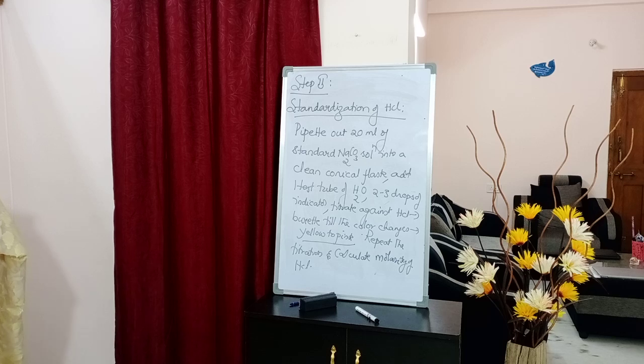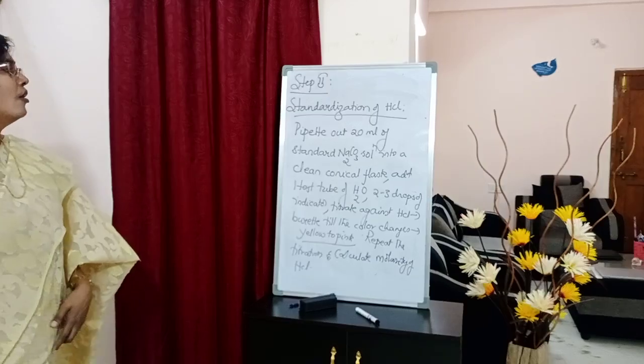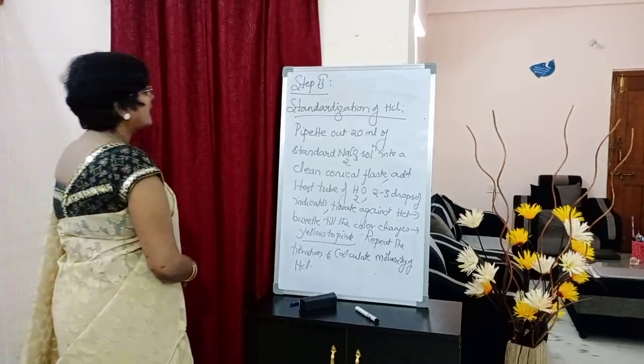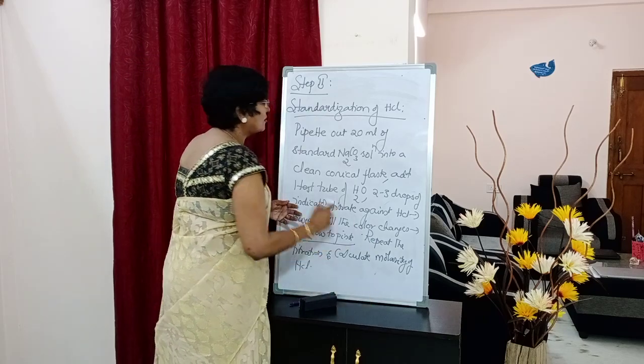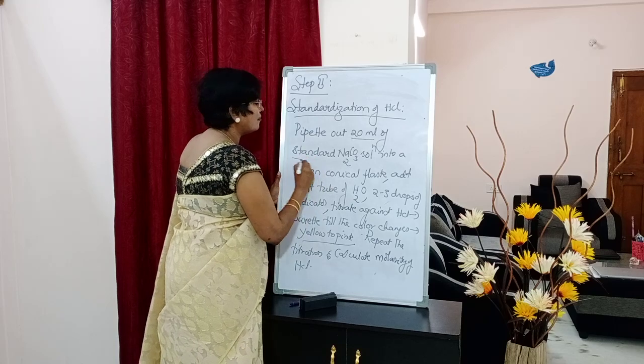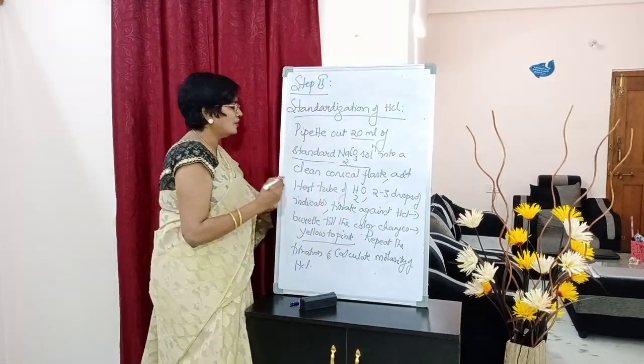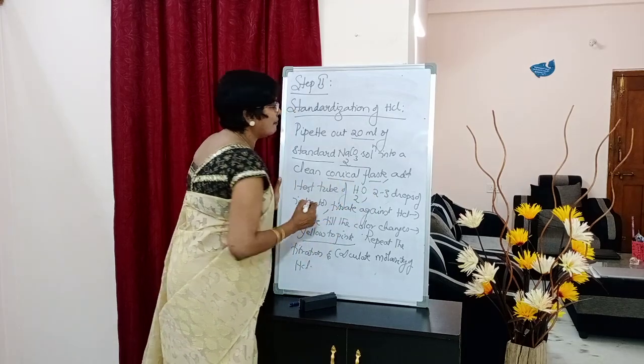Pipette out 20 ml of standard Na2CO3 solution in a clean conical flask.